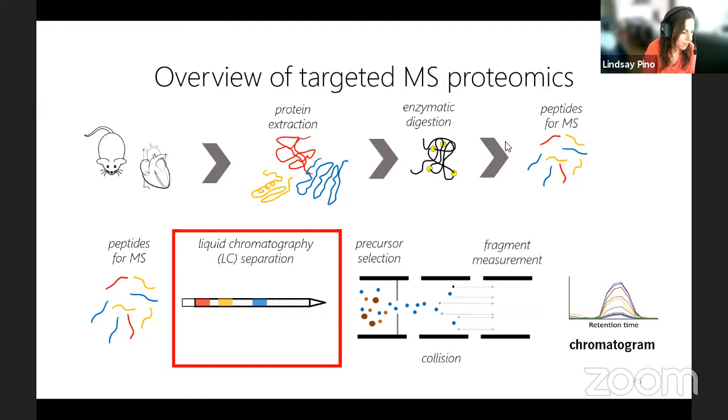How many precursors do we need for good quant info? So you only need one precursor per peptide sequence, but for each protein, you should have at least 2 peptide sequences per protein that you're measuring.